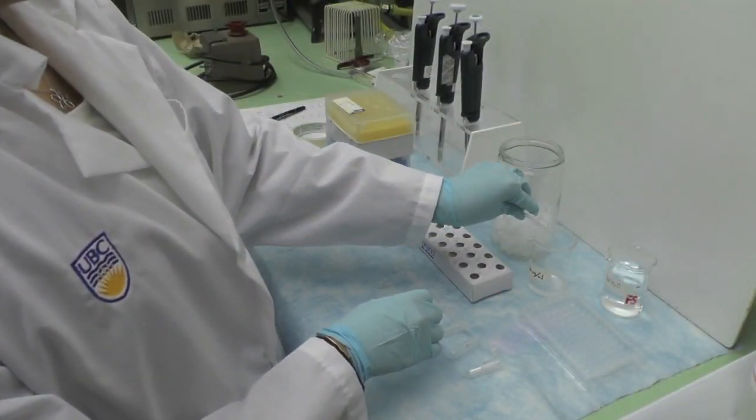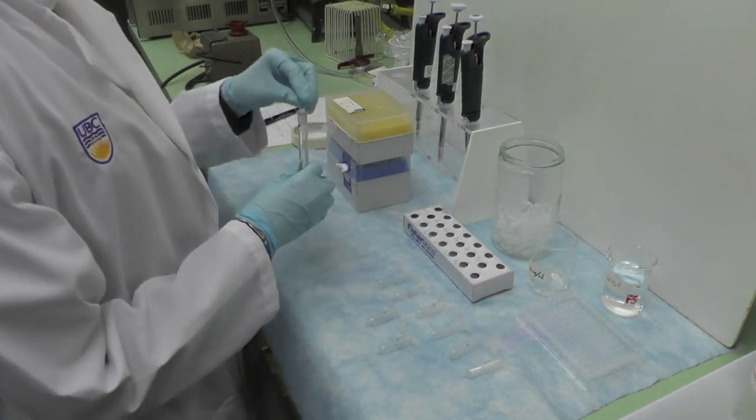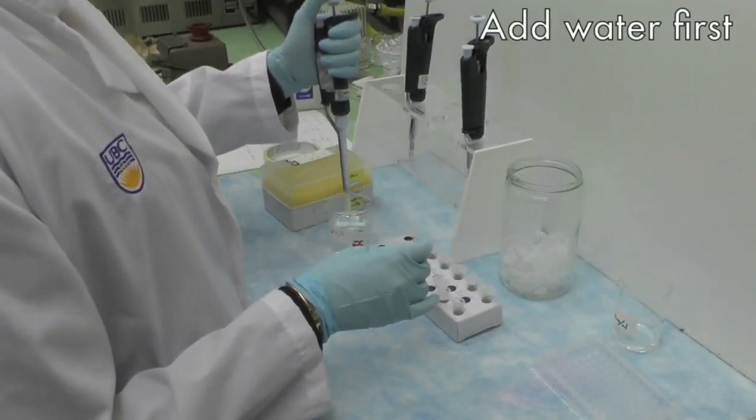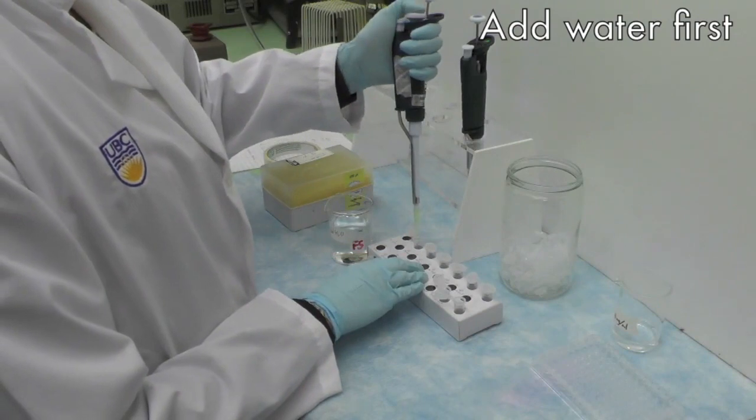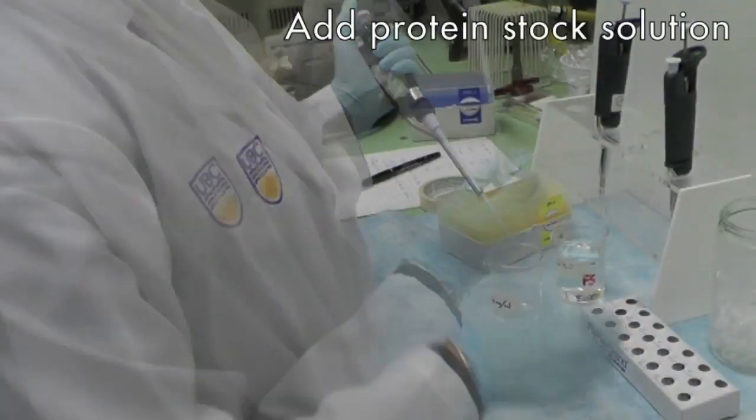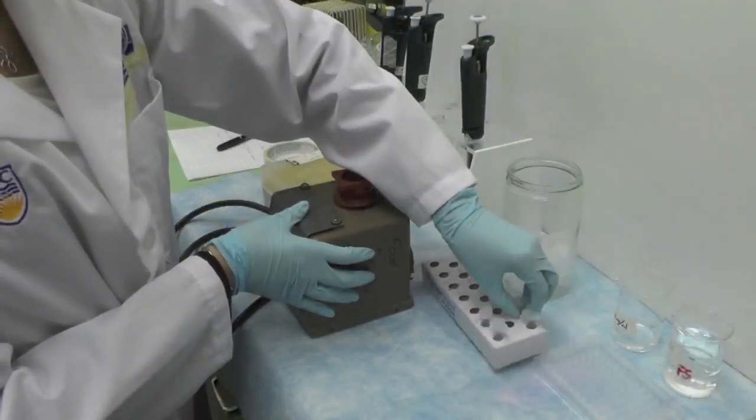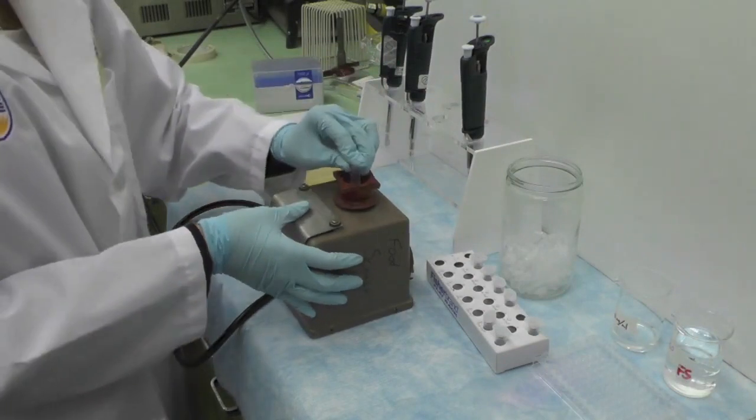Based on your pre-lab calculation targeting to make 100 microliters of each standard solution, first pipette the appropriate amount of DD water into the microfuge tube. Then add the proper volume of protein stock solution. Vortex the microfuge tube to mix the solution.